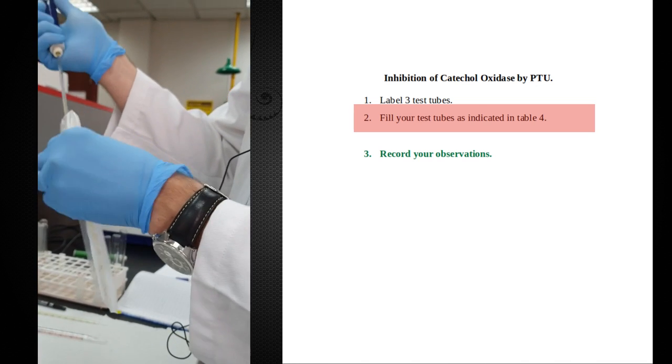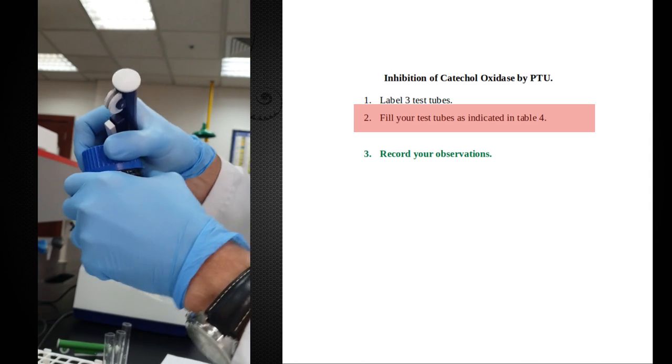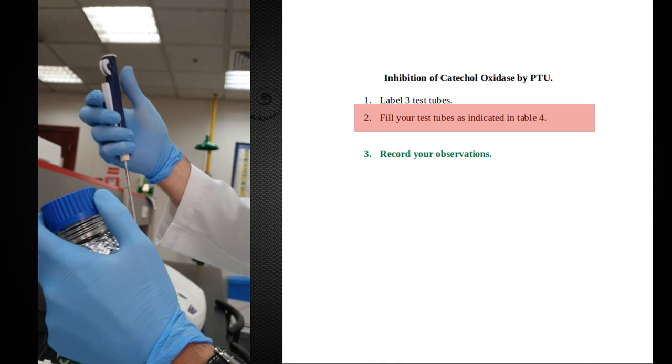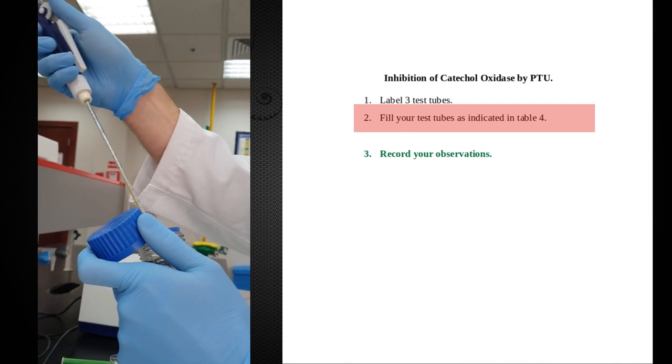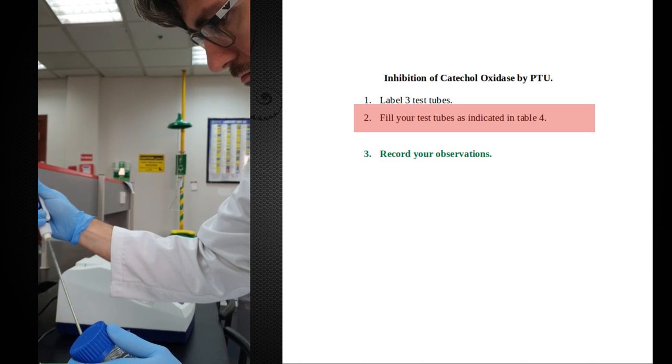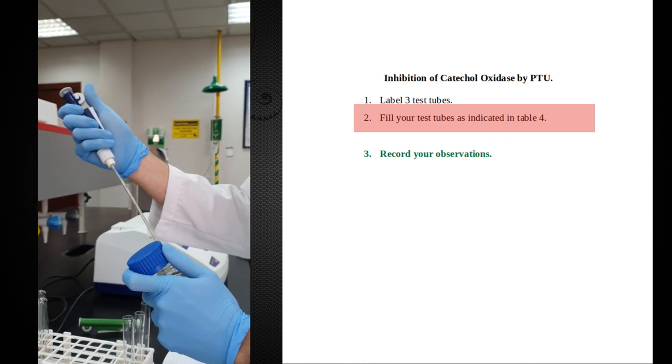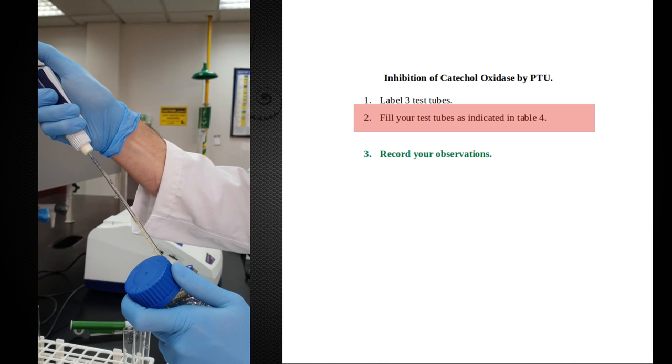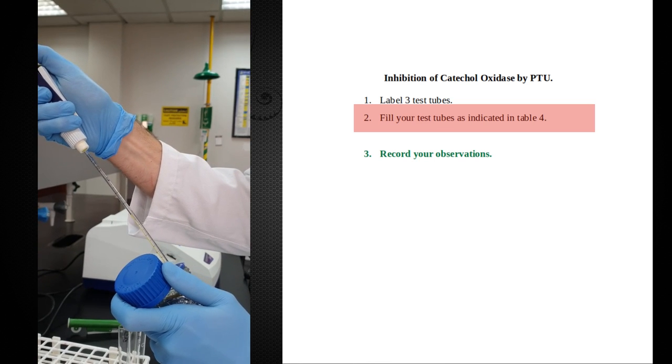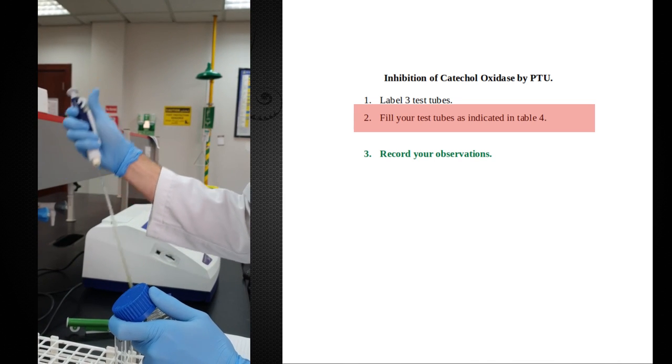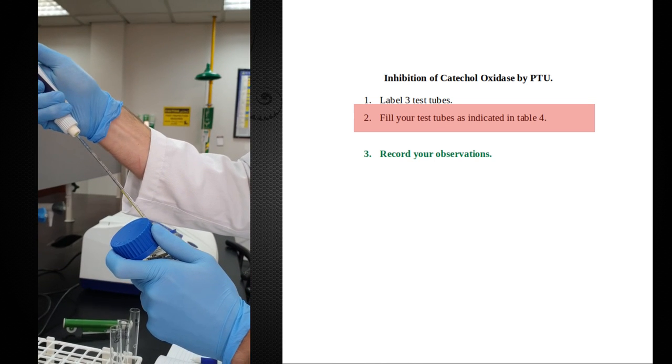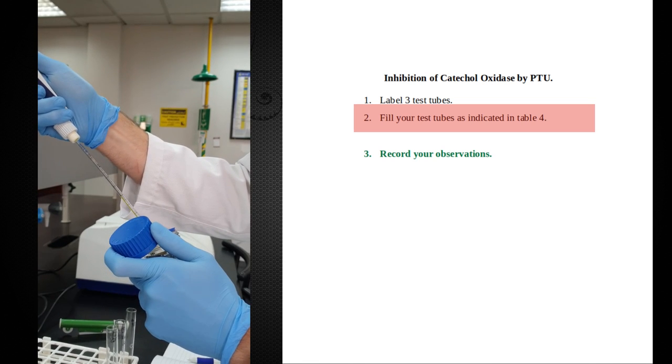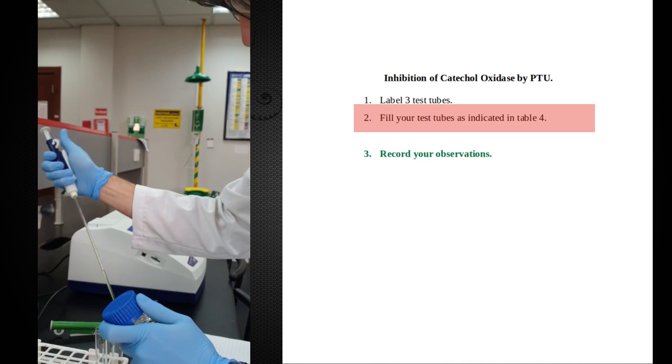Tube one needs half a milliliter. Tube two will get one milliliter, so I'm going to bring this all the way up to the top. That's one milliliter. And tube three gets half a milliliter again. There we go, that's half.